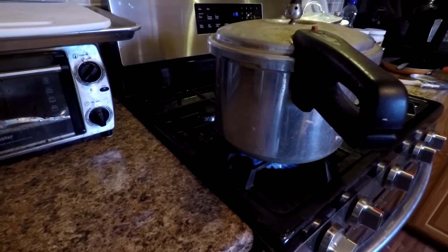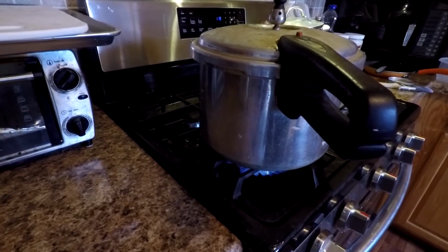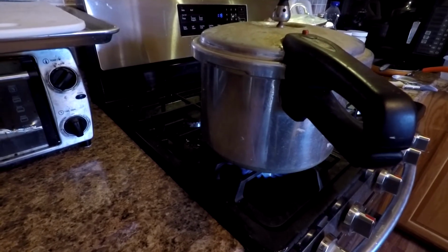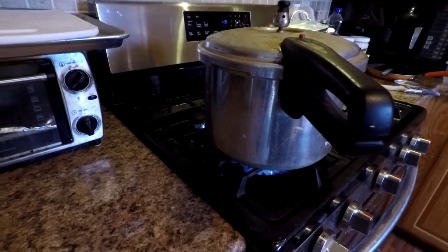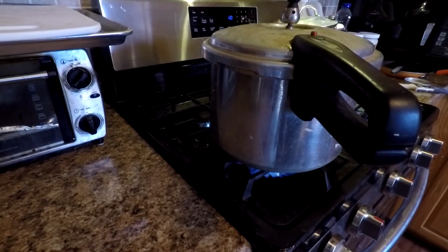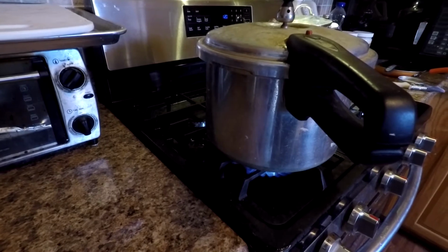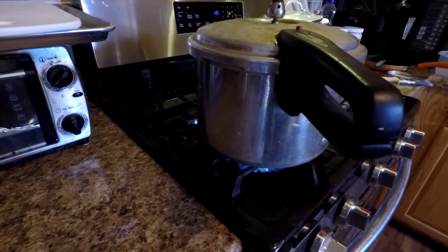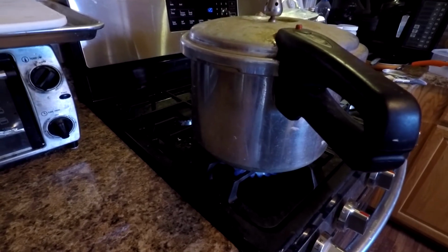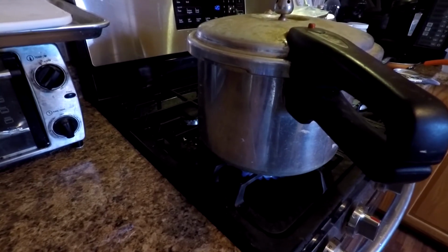Just remember that one dish of the black morels rye. I inoculated a lot of it in the center with the inoculation loop. And that was just an inoculation loop, hardly any spores on that. But getting enough in just one location in the center of the dish caused the mold problems. No bacteria with that, it was just mold. So I'm going to sterilize another syringe in a jar, and we'll take a look at how I'm going to do all this.